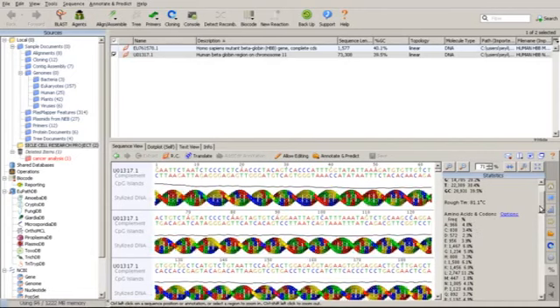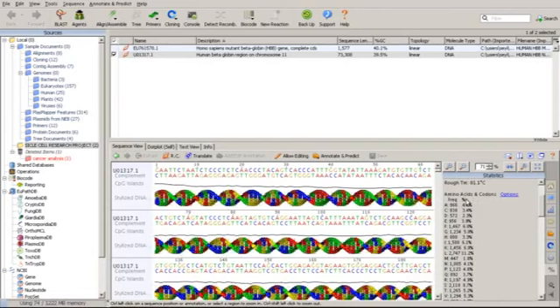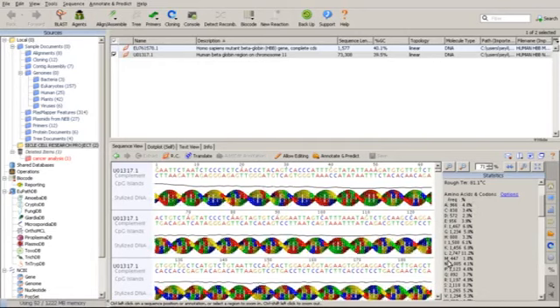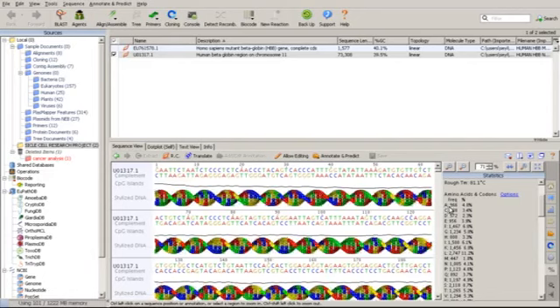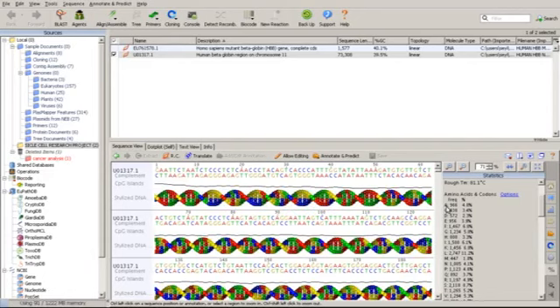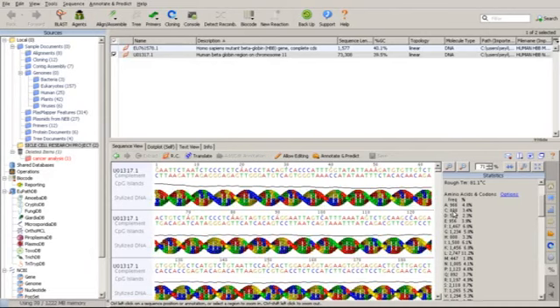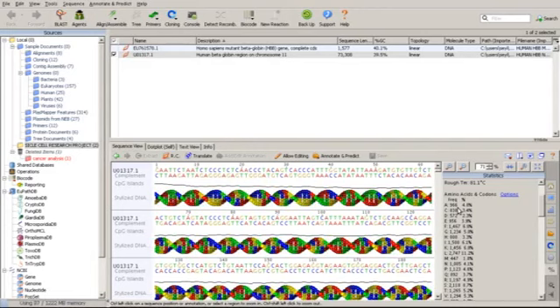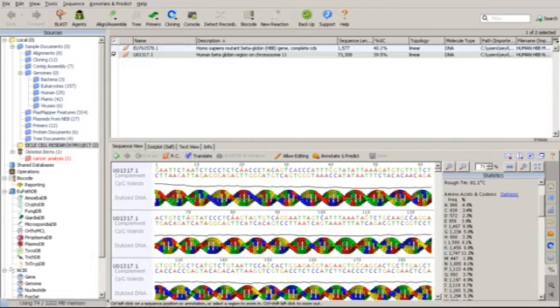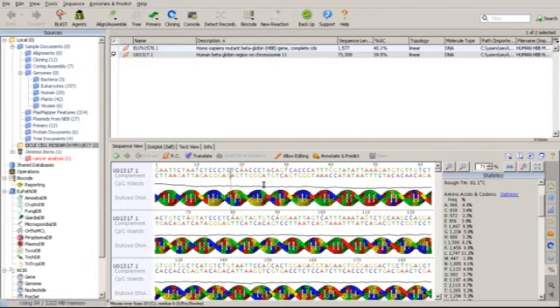Now we have amino acids and codons. This is telling us the statistics of each amino acid in this nucleotide sequence. This is telling us that A, which is alanine, occurs 966 times in the whole of this sequence, according to the codons that have been predicted.